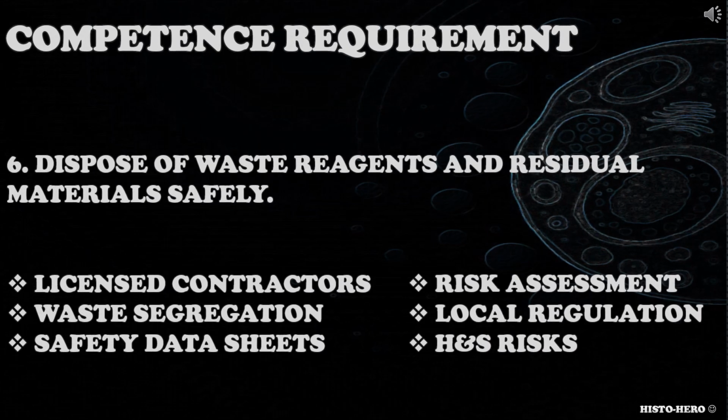The sixth competence requirement is dispose of waste reagents and residual material safely. Candidate should be able to safely dispose waste generated. Does the candidate dispose detection reagents and residual material safely? Do they follow local procedures and avoid risks associated with detection reagents? Segregate waste as per regulations?